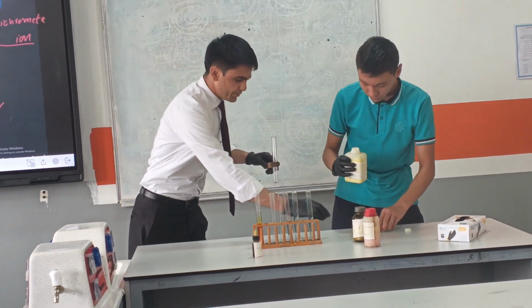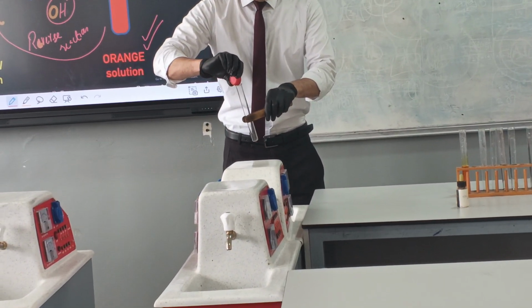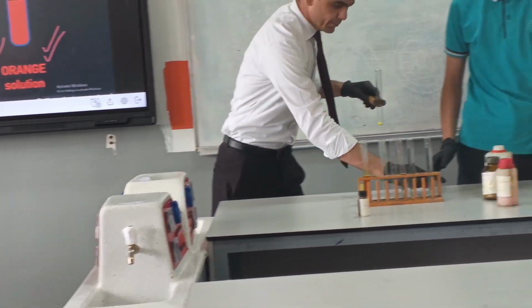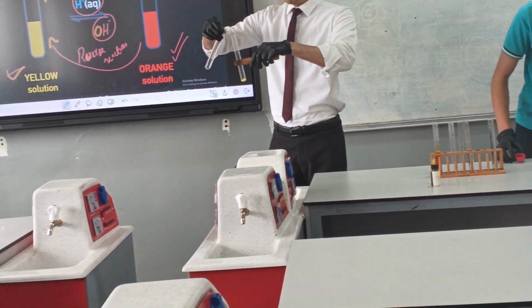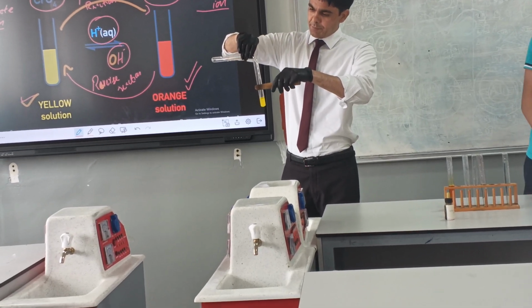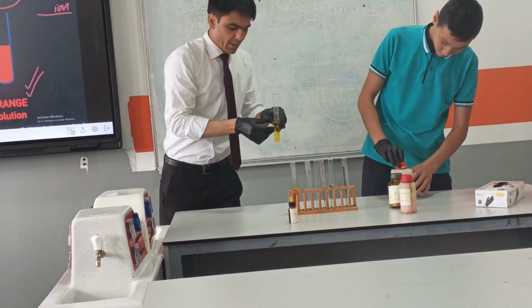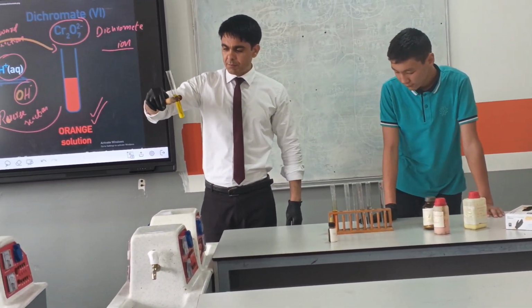It's enough. Now let's see its color. It must be yellow. You can see. Again, let's dissolve it completely.